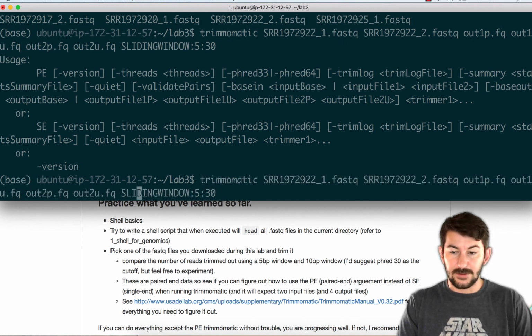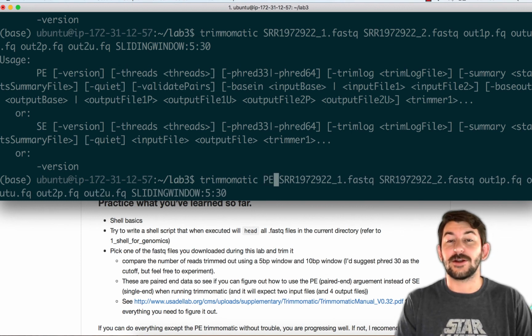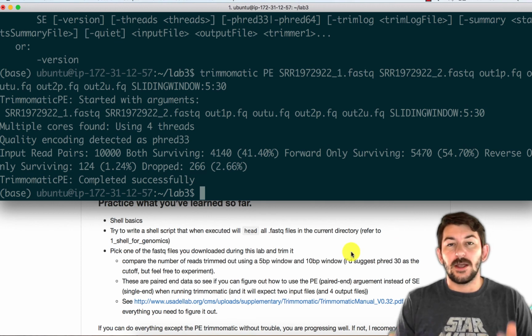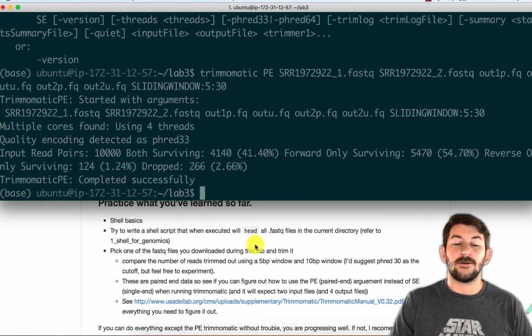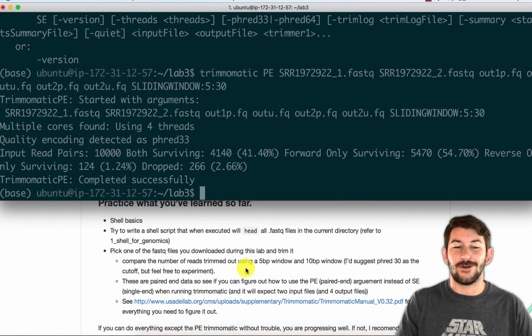And so something happened. Of course, see, even I make silly mistakes. I didn't put paired end at the front. And there we go. And that worked. And so if through this point in the lab, you were able to figure out, not from memory, how to do some of these things, other than doing the paired end reads at the same time, that's a little trickier. You're doing pretty well, and so you should be proud of yourself. All right, thanks.